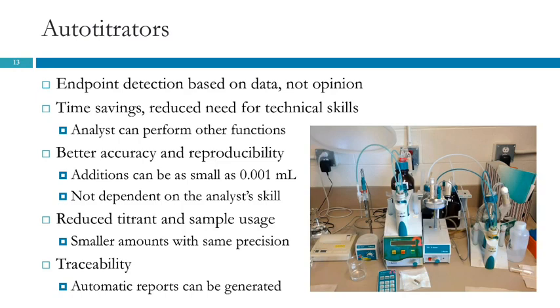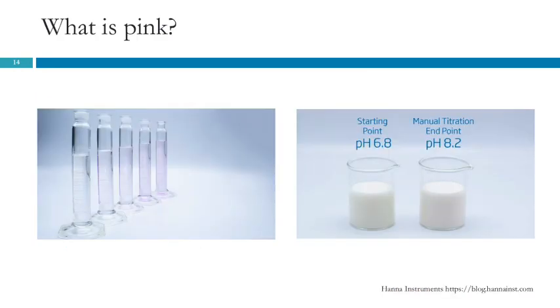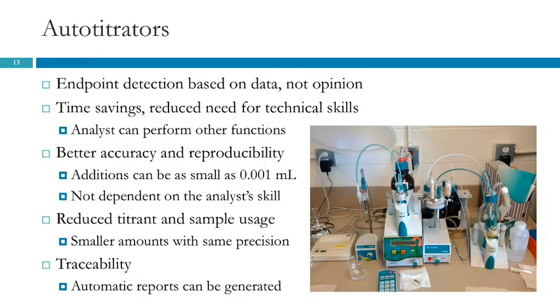Was there a pH probe on the left-hand side of the auto titrator here? Is that a pH probe? You know, I am not even really sure. That does look like a pH probe right there. This is definitely a stirring plate. Here's the reservoir for the titrant. I'm not sure exactly what this is doing. There were so many of them, I just picked one that had decent resolution that wouldn't be all fuzzy when I stuck it up on the screen.